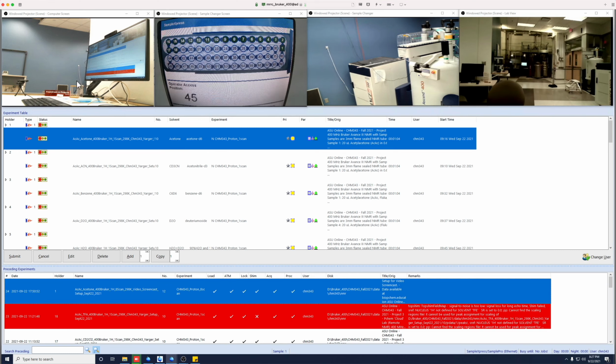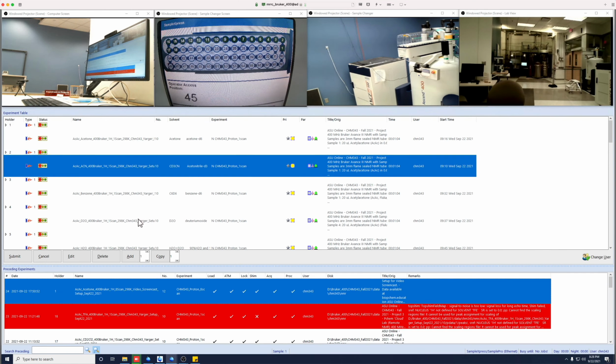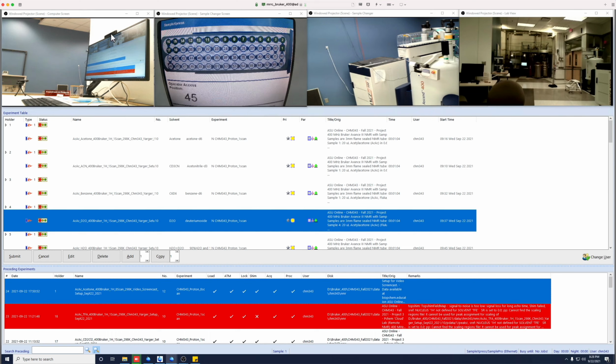Again, this is the computer. We're kind of looking at it right here. So if we click different things, you can see it's a live view of this screen. The webcam on that screen is looking out into the rest of the lab where we can see the 500 megahertz Bruker autosampler walk-up system, the 800 megahertz NMR, etc. in the Magnetic Resonance Research Center in ISTB1 at ASU.